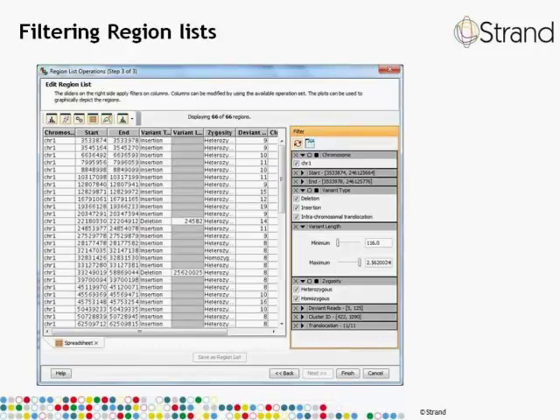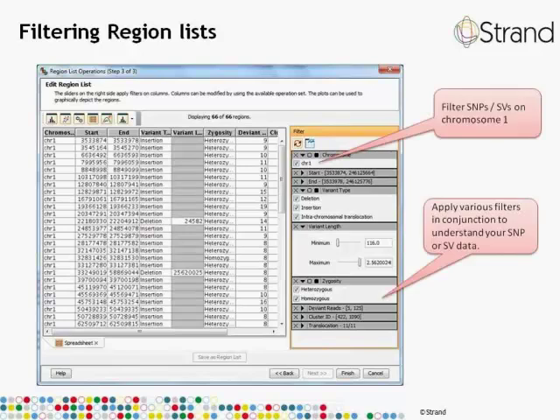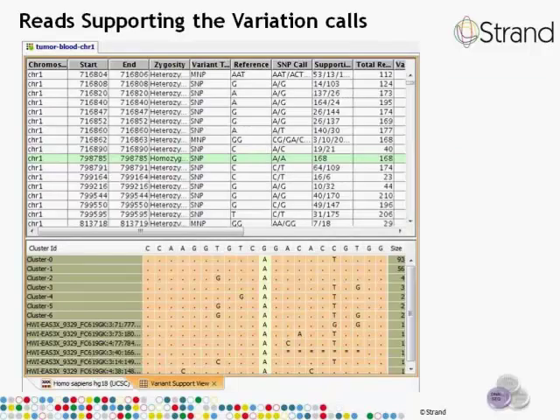You can further filter your reads on chromosome and more precisely the exact location. Similarly, you can filter to see only deletions or insertions that are probably either homozygous or heterozygous in the tumor sample. One can further delve into the data to verify a SNP call.